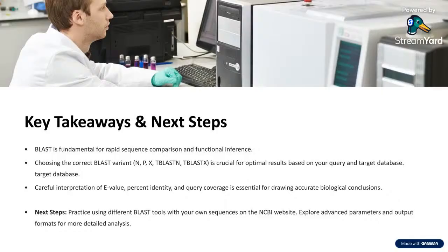When we suspect our DNA might code for a protein, but we do not know the exact protein, then we use BLASTX. If the DNA is unknown and unannotated, we also use BLASTX.